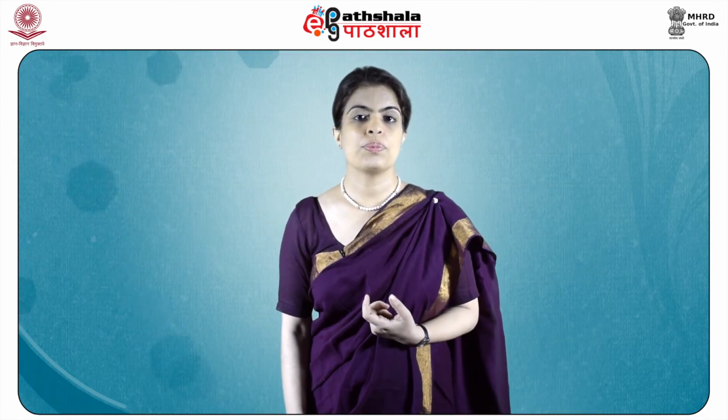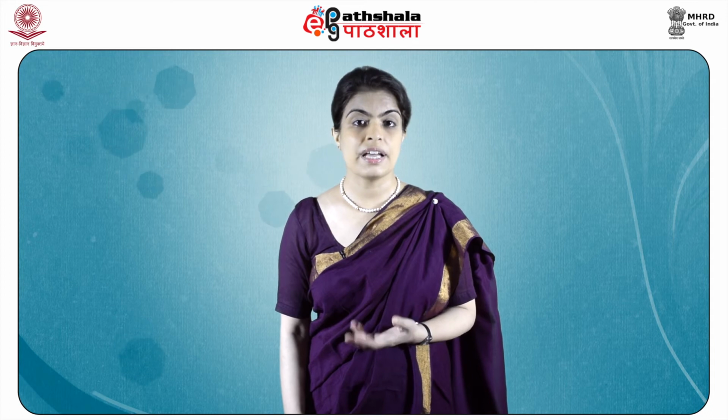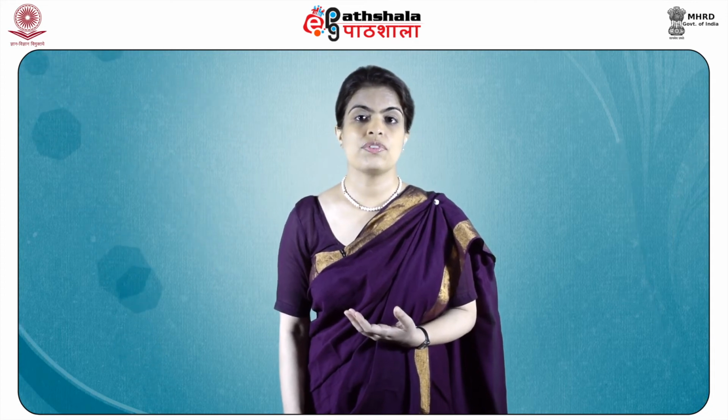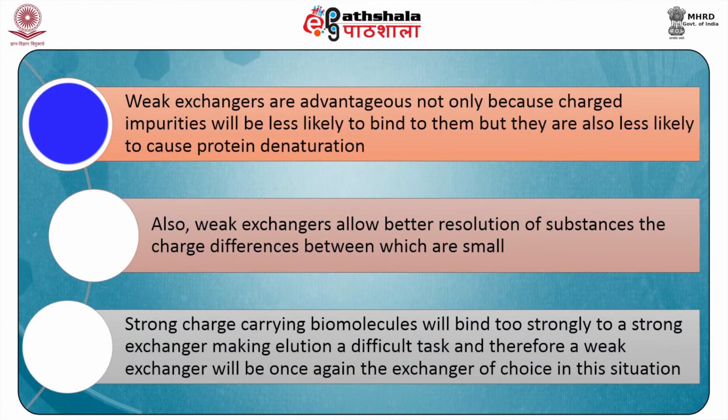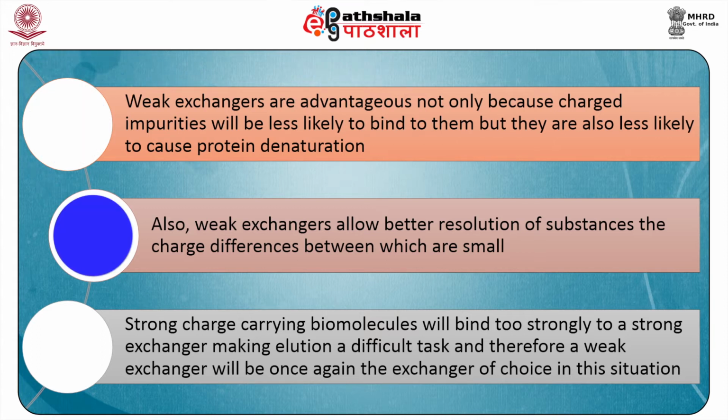Since strong exchangers operate over a wide pH range and weak analytes require a very low or a very high pH for ionization, separation of weak analytes can be achieved on a strong exchanger. Similarly, weak exchangers will be suitable for binding strong electrolytes. Weak exchangers are advantageous not only because charged impurities will be less likely to bind to them, but they are also less likely to cause protein denaturation. Also, weak exchangers allow better resolution of substances whose charge differences between them are small.